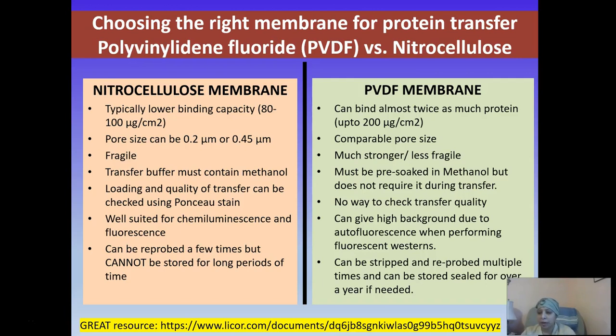If you have a perfect blot, you can reprobe it even a couple of years later with a new antibody or another thing that you need, and get those extra results without having to go through the entire experiment again, which can be a very, very good thing when you're looking at publications and sending papers out and answering reviewer response.